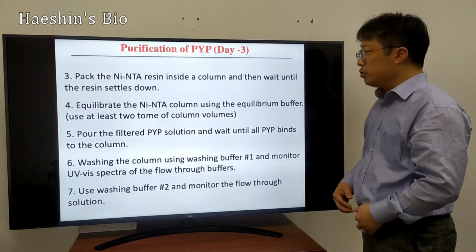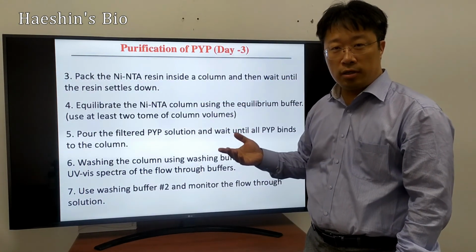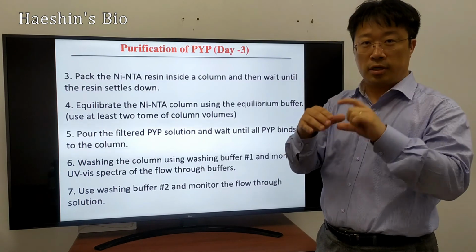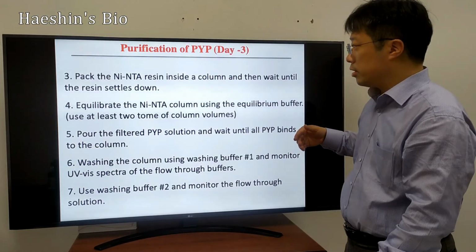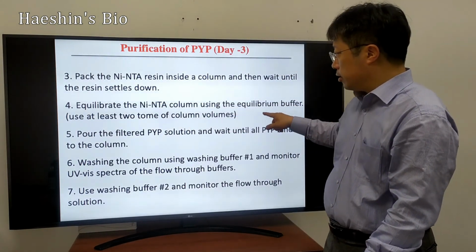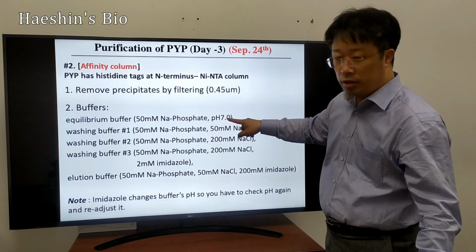So the actual procedure: packing the resin inside the column. So it's like a GPC resin that I showed you before. Remember that I added powder, then you put the water and then they swell, becoming like that resin. And similar procedures as here. And then that resin is equilibrated with basically this solution, sodium phosphate buffer pH 7.